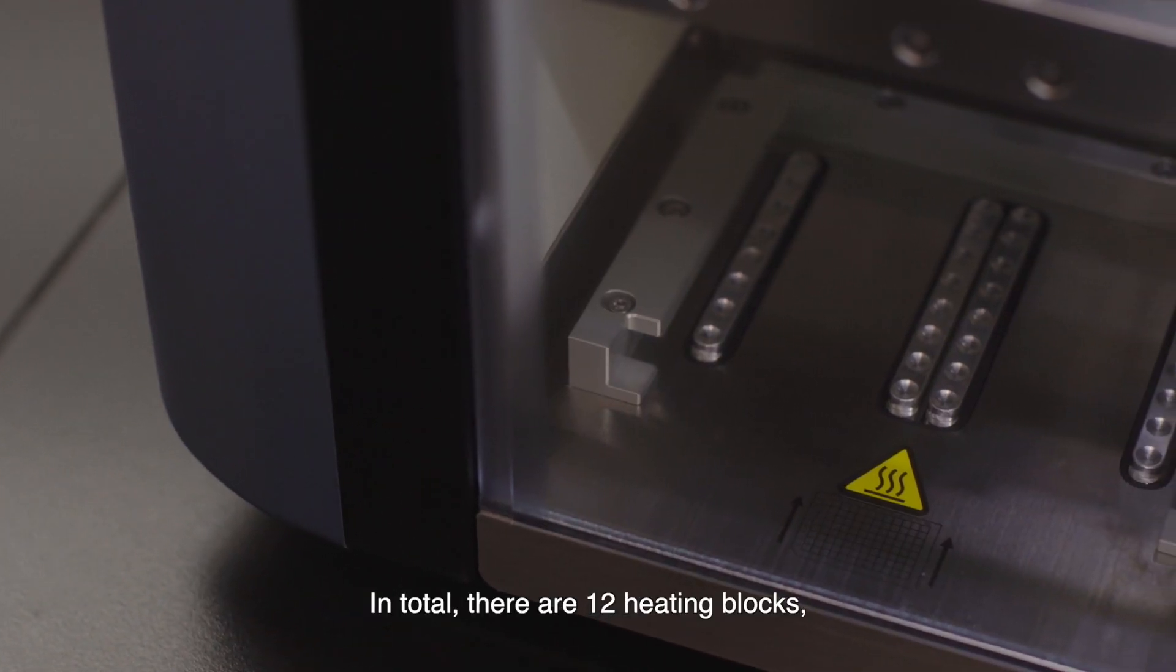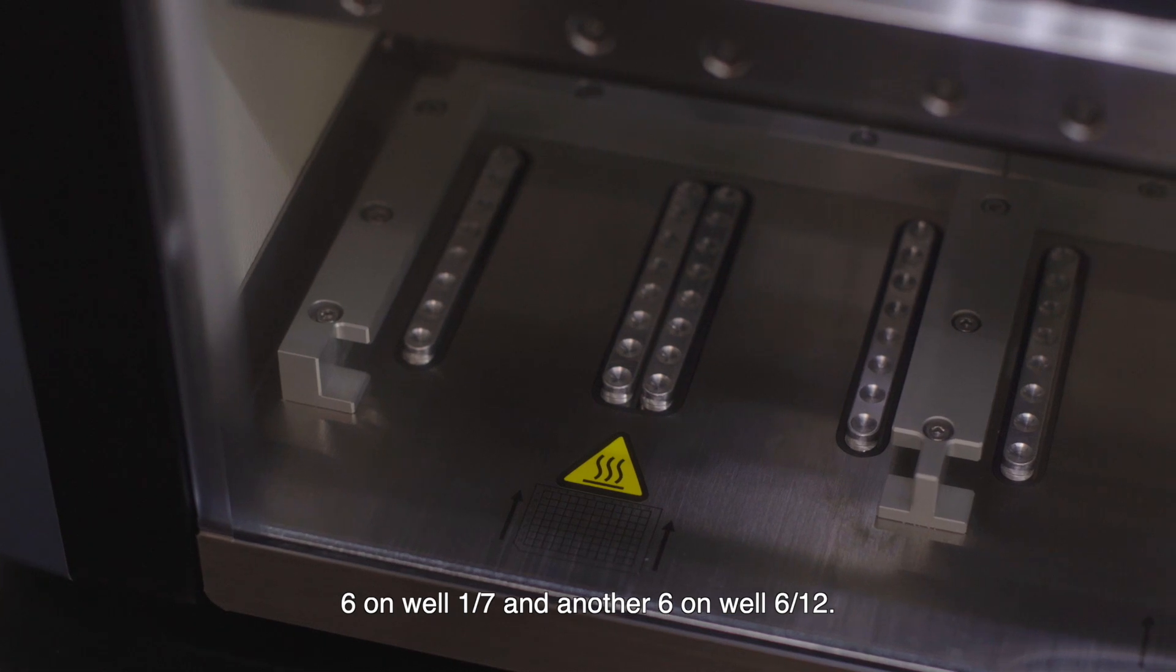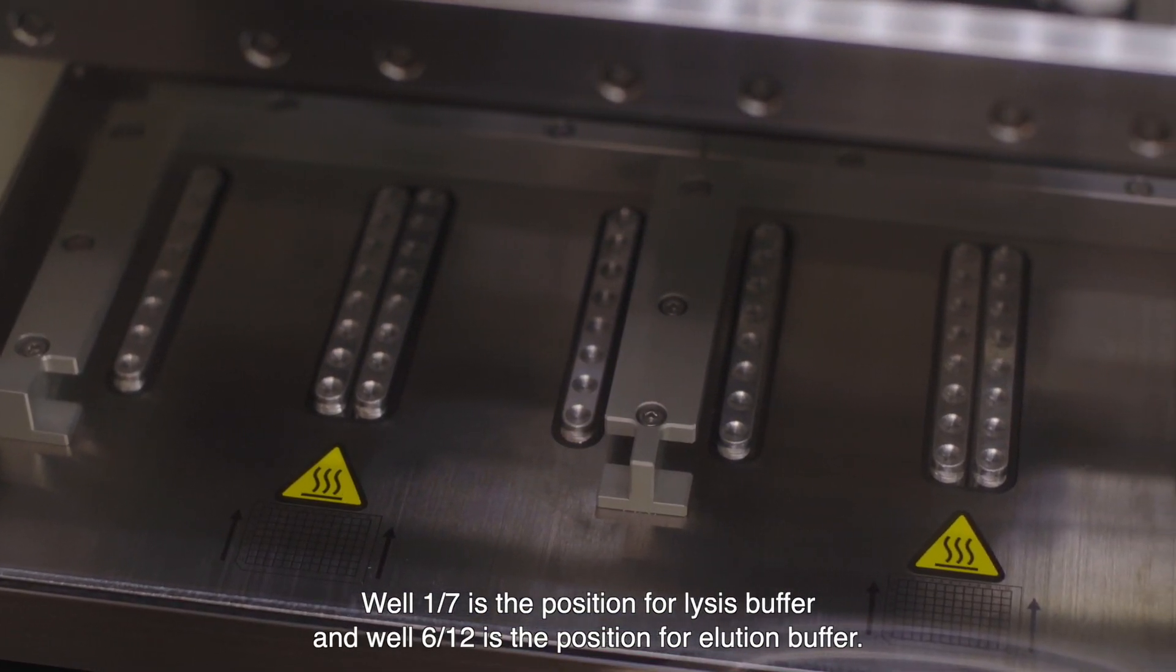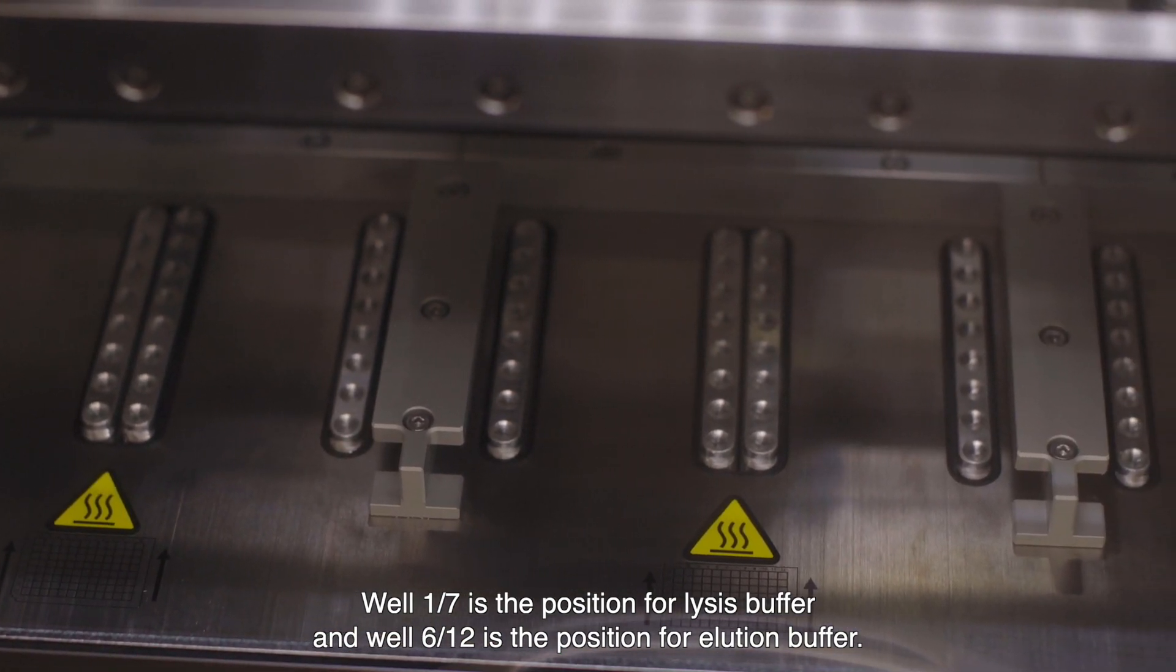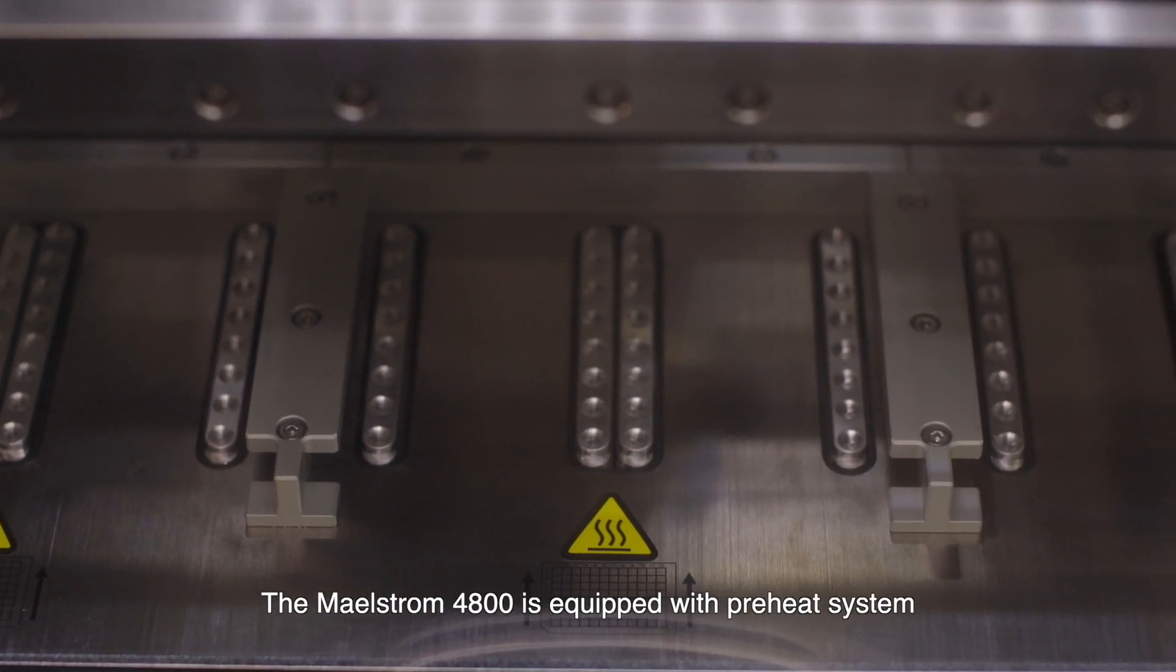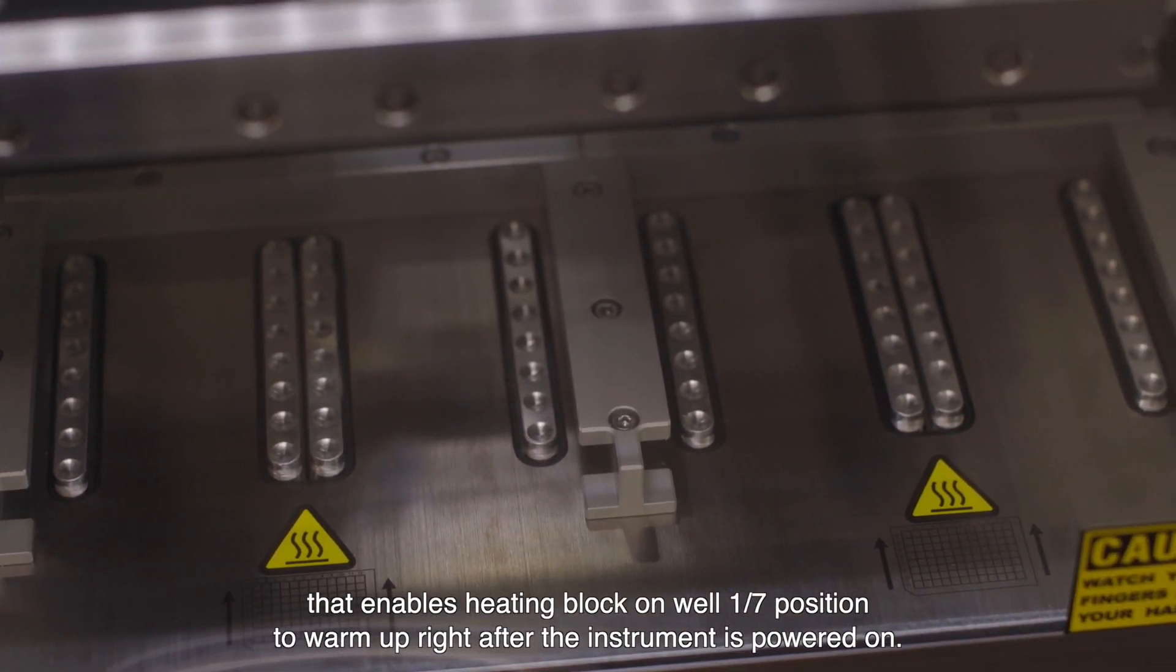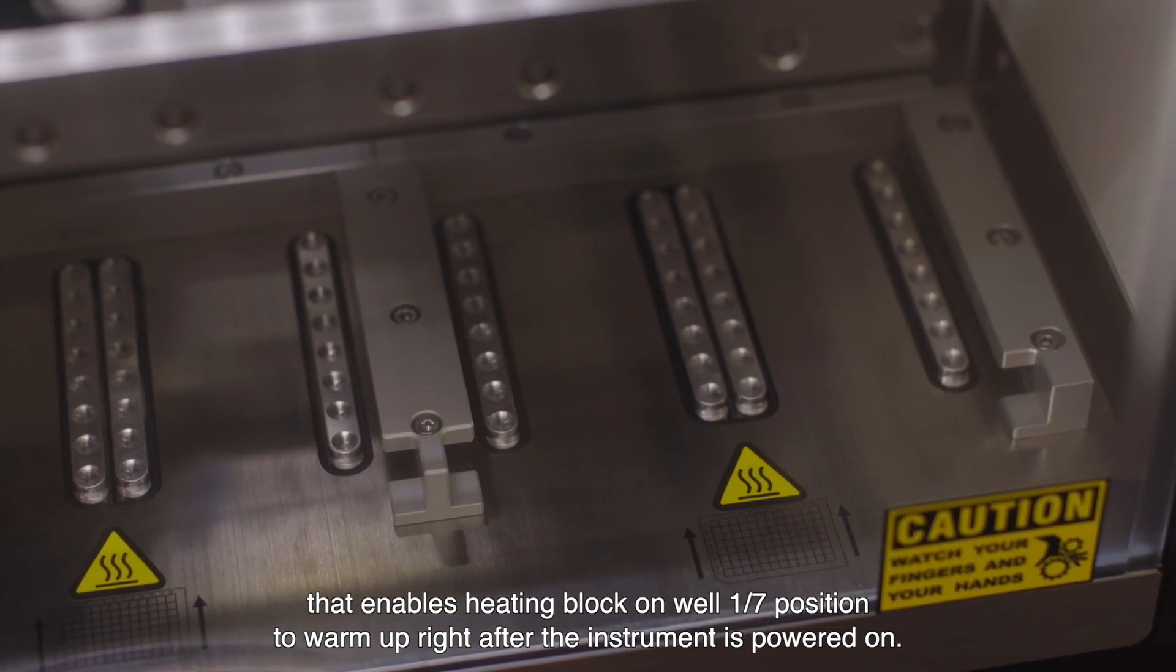In total there are 12 heating blocks. Six on well 1 and 7 and another six on well 6 and 12. Well 1 and 7 is the position for lysis buffer and well 6 and 12 is the position for elution buffer. The Maelstrom 4800 is equipped with a preheat system that enables heating blocks on well 1 and 7 position to warm up right after the instrument is powered on.